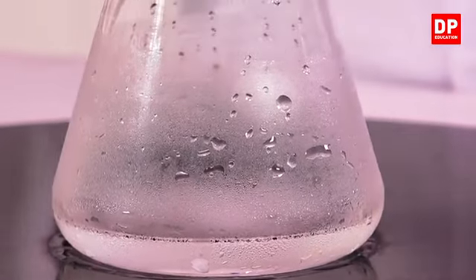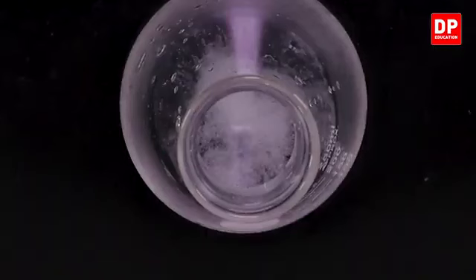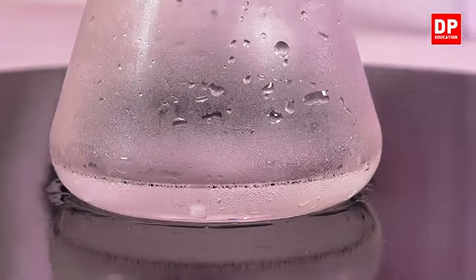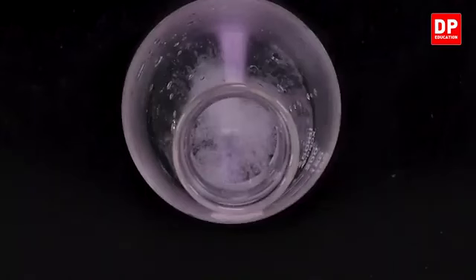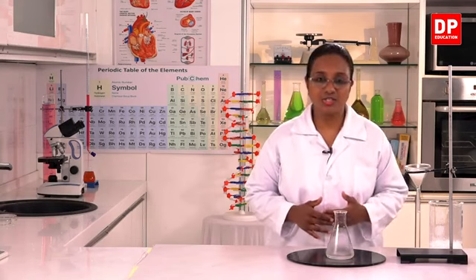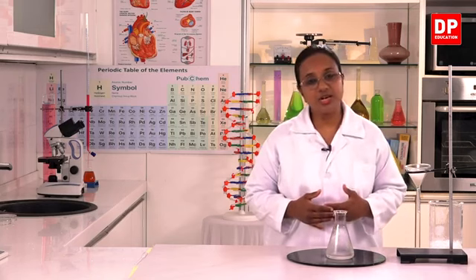Only a small amount has been formed because during the process impurities are removed and also some of the crystals form on the way, that is through the funnel, and also there can be some crystals still remaining in the beaker. So, here what I have is the pure salt crystals. Impurities have been removed and only the sodium chloride has crystallized. So, this is the process of recrystallization, and we use this to purify solid substances or to remove impurities from solid substances.